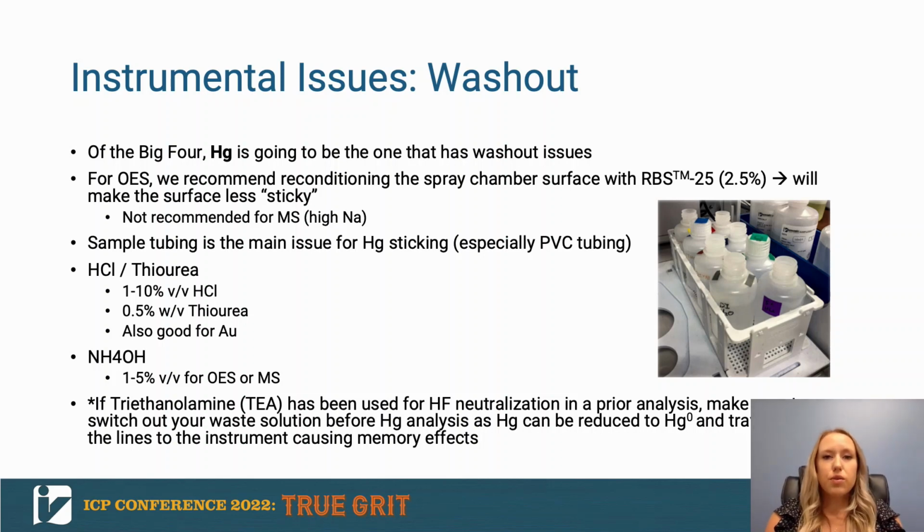So if you do have that in your waste container, just make sure to dump that or switch out your waste container before performing your mercury analysis.